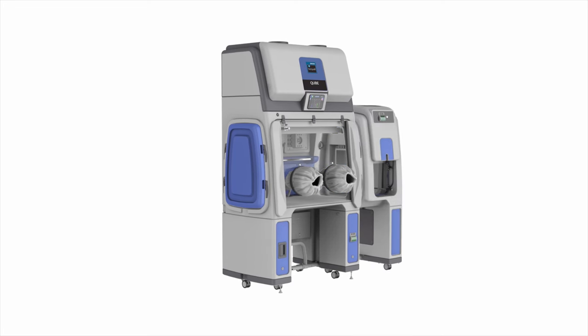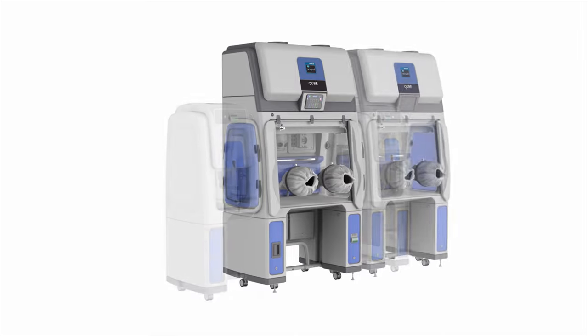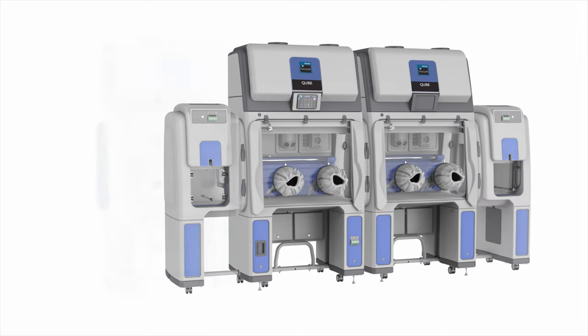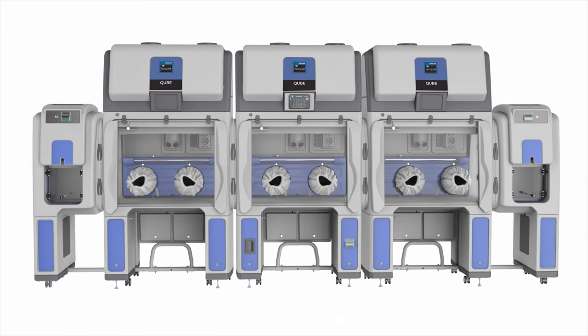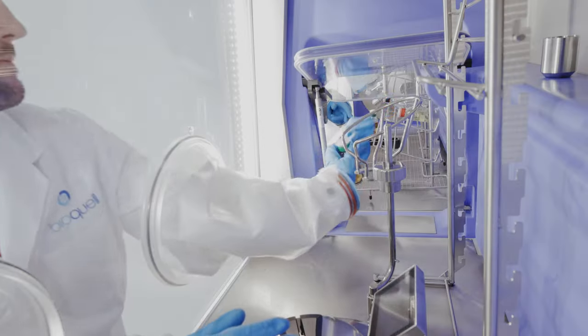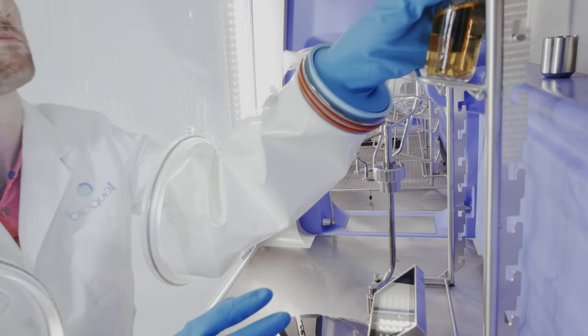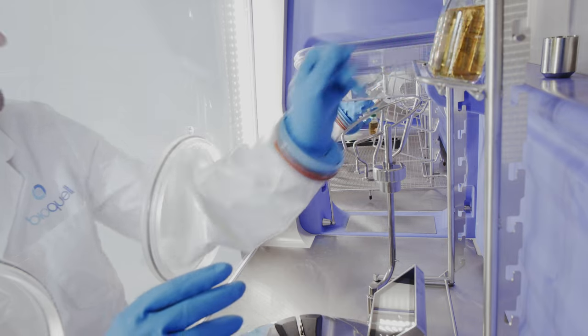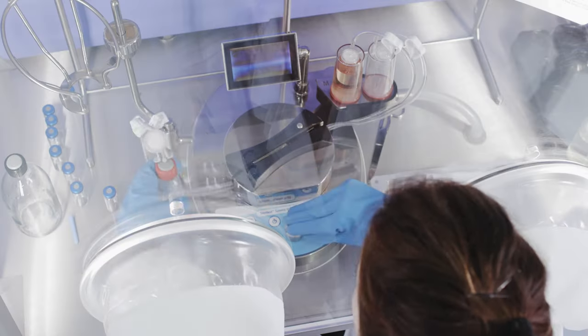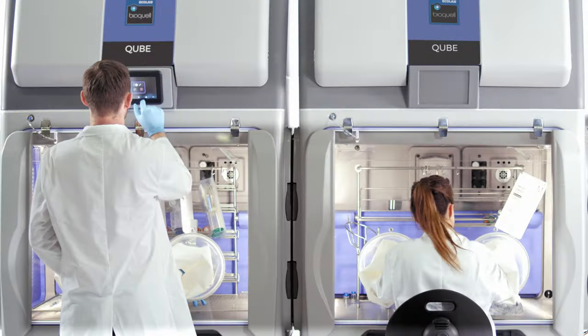Each BioQuell Cube can be tailored to your requirements now and at a later date. Its modular design allows you to add or change configurations as needed. Technicians enjoy working with a BioQuell Cube because it has been designed with their comfort as a core feature, aiding in a highly optimized and thoroughly efficient workflow.